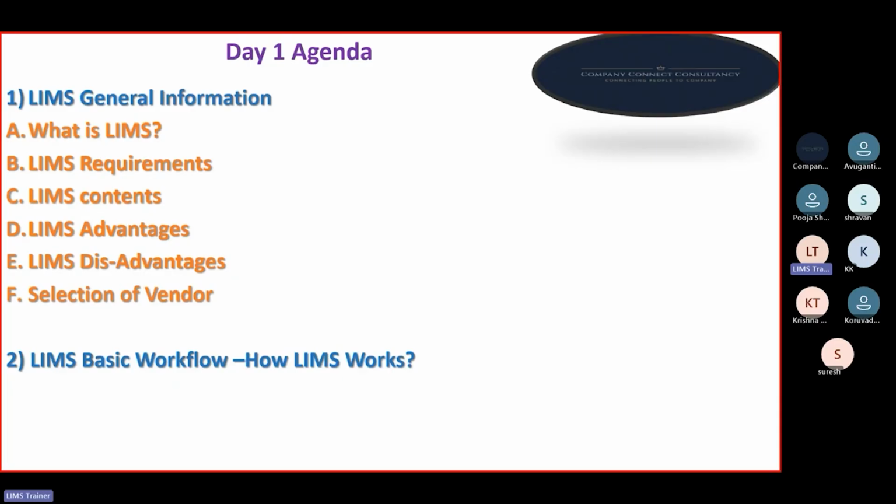Right now, this LIMS software is mostly mandatory in all pharmaceutical laboratories. If there is any regulatory compliant laboratory, the LIMS software is mandatory for them as per the US FDA and other regulatory bodies. So right now that is the demand for LIMS.